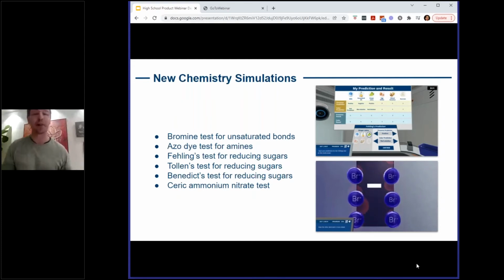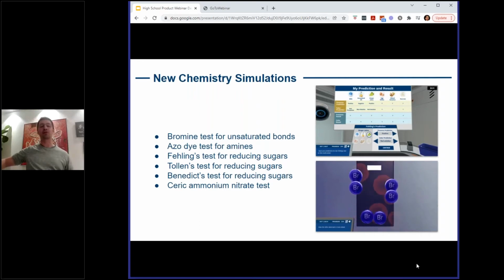Thank you, Anastasia. I'm going to talk about 6 different chemistry simulations, and I'm not going to talk about all of them in detail. We have created 6 different simulations focusing on tests for different functional groups. These simulations are shorter, about 10 minutes plus or minus. They're designed to be easy and quick to do.